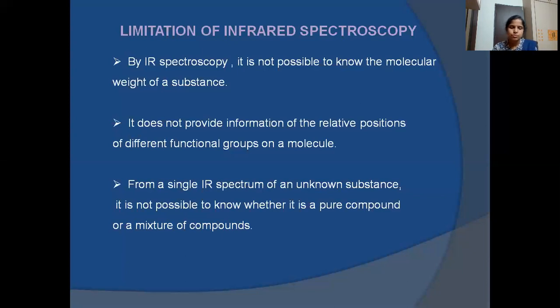So if you remember these main important points and practice as many spectra as you can, take an unknown spectrum and try to solve it. First look for the bands at the 3000 mark, then try to interpret each band.